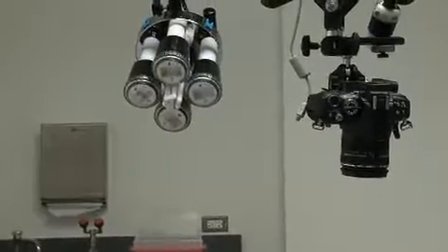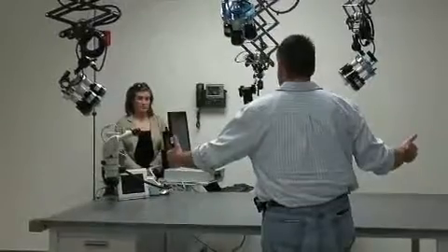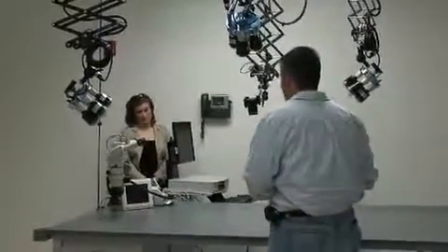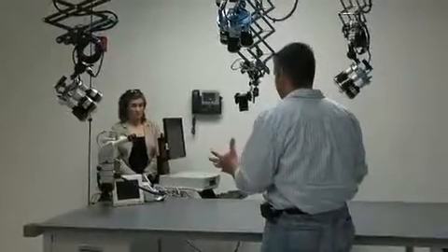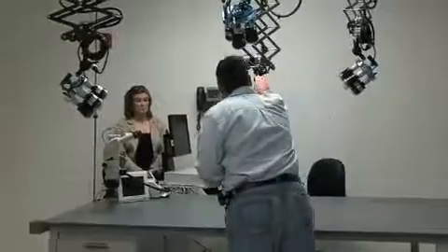What's nice about this system, though, is that, as I stated before, we can put a large item down on these tables, and the camera will actually run through the computer that you're standing in front of, and it'll give us a live view of the image. So we can do all focusing as far as moving the camera around.